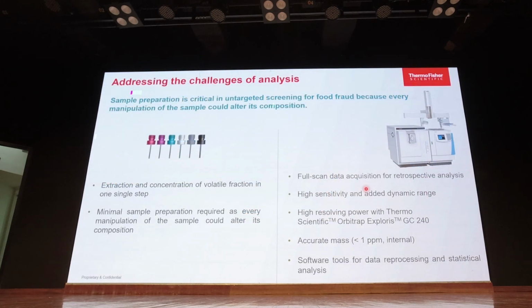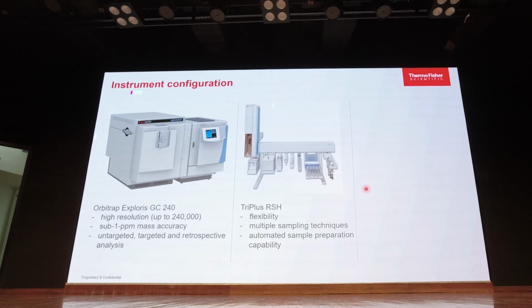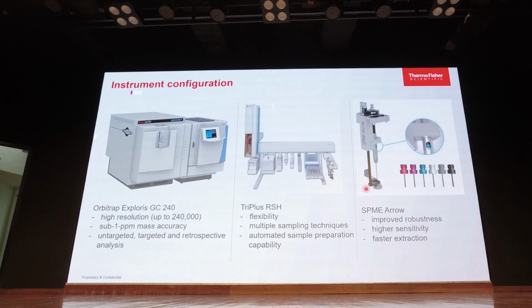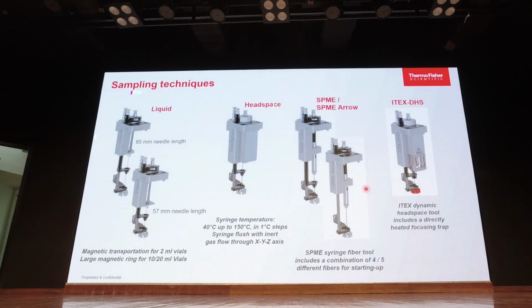So this is the instrument with the SPME fiber. This is the tool that we are using, which is a TriPlus, which can do liquid, headspace and SPME. You can change this tool automatically.